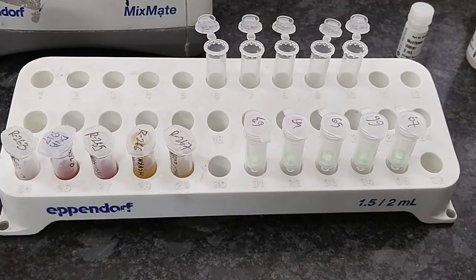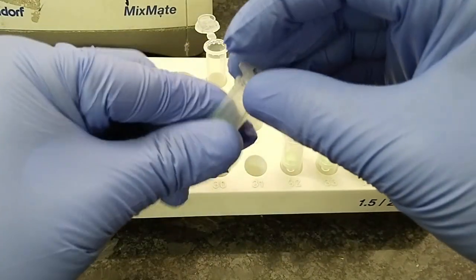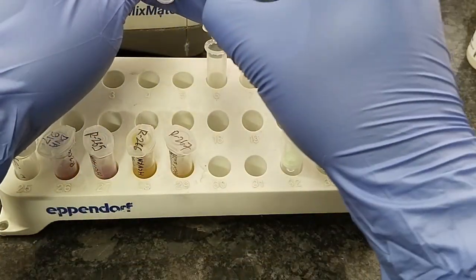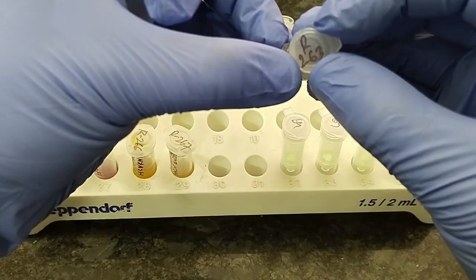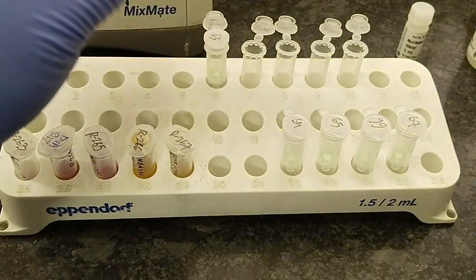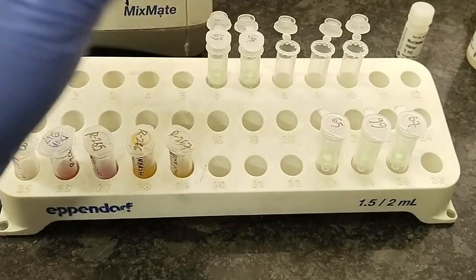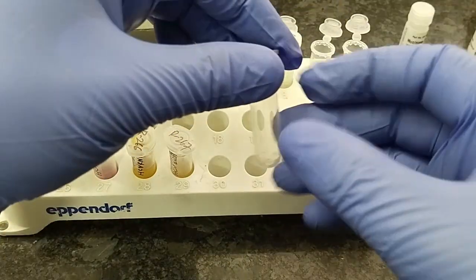Dry spin has been done. Then it is time to remove the collection tube and put the column into another tube. I have marked the tube already, so now collect the column. All columns are collected, and discard the collection tube.